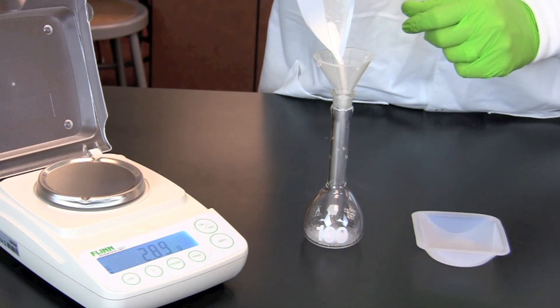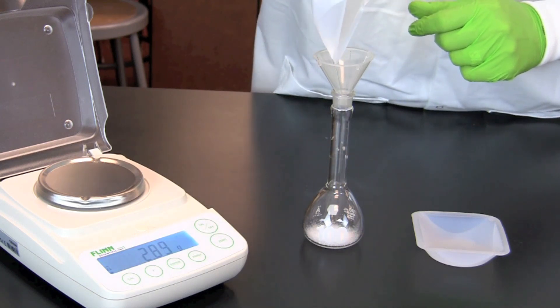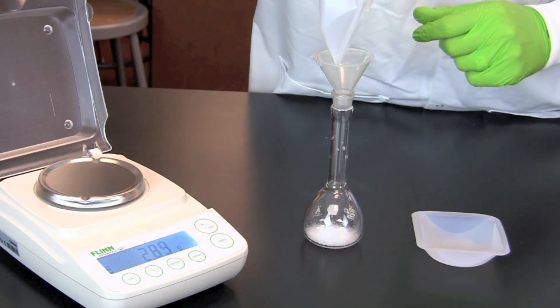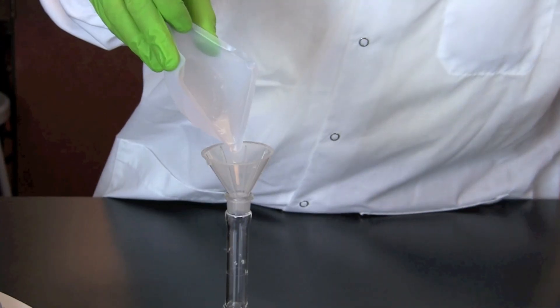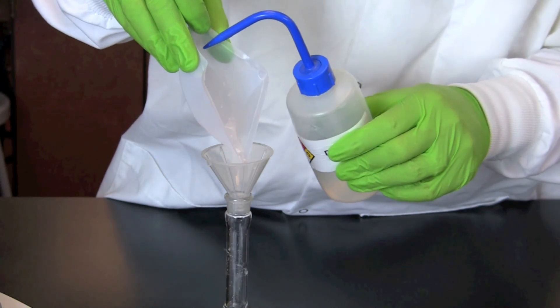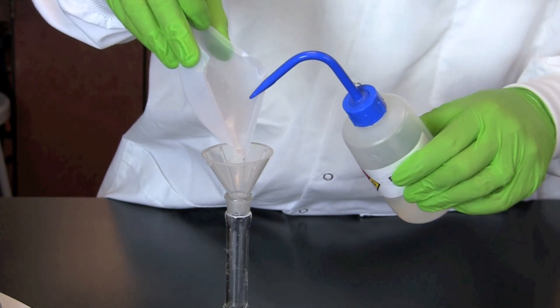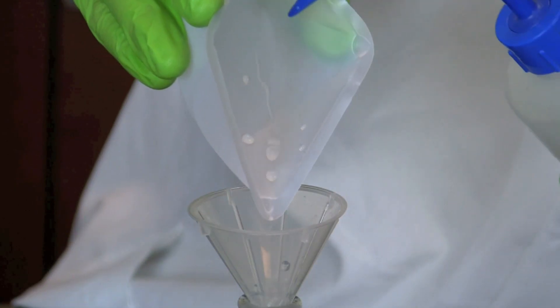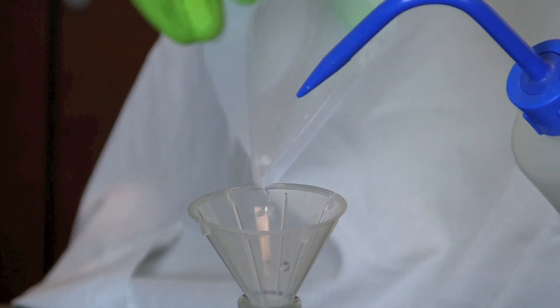We then take the weigh boat with the correct amount of sodium chloride and transfer it into the flask. Use a squirt bottle filled with distilled water to rinse the remaining sodium chloride crystals from the weigh boat into the funnel. Notice that the weigh boat is hydrophobic and repels water.